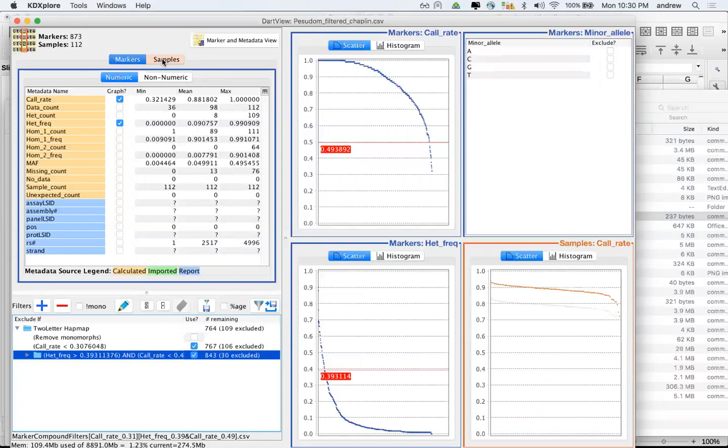I imagine it would be some sort of API which we would interact with. Yes, some type of API, just like Liz was mentioning, APIs to bring data into this, and APIs to, in effect, put data back. Yeah, we can definitely have a look at that.